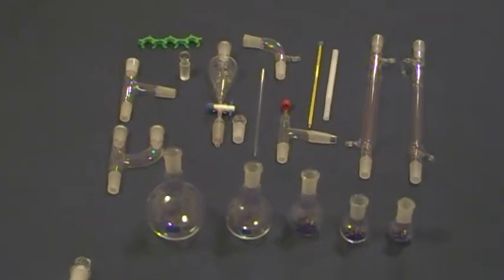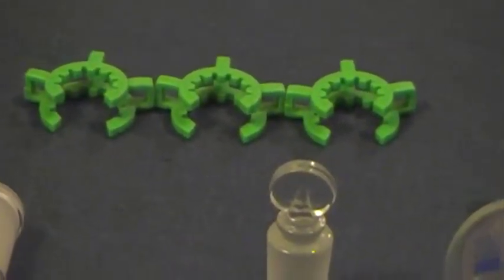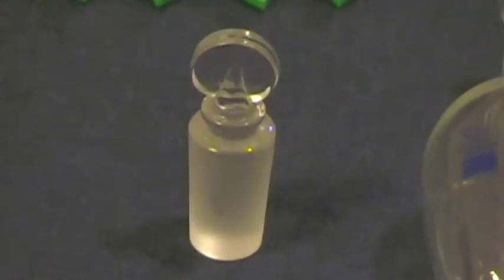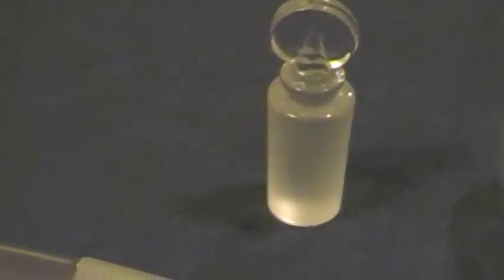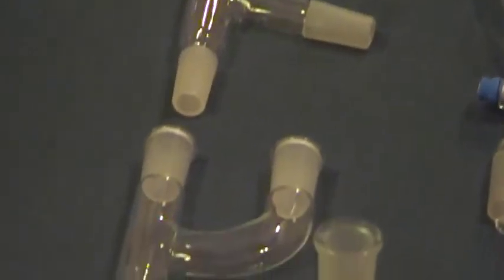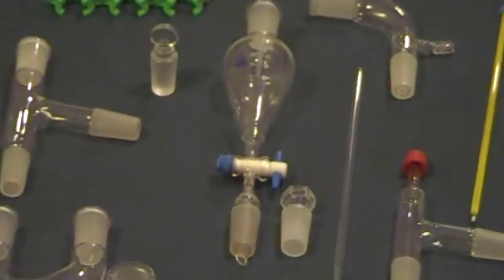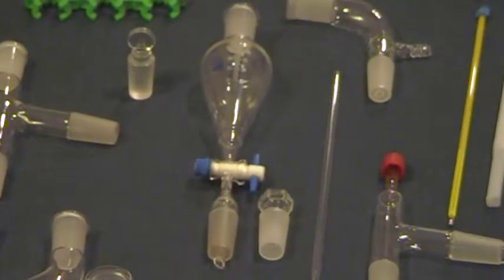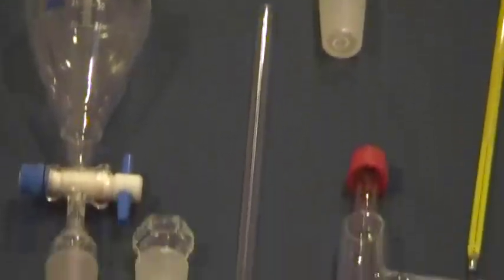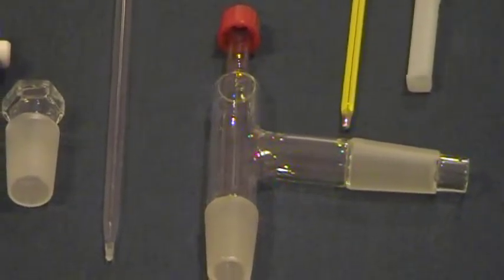This kit comes complete with the following: three plastic kit clips that are 24/40; one solid Pennyhead Stopper 24/40; one three-way adapter; one Claisen adapter; one 125mL separatory funnel with glass stopper; one vacuum take-off adapter; and one three-way thermometer adapter with plastic cap and O-ring.